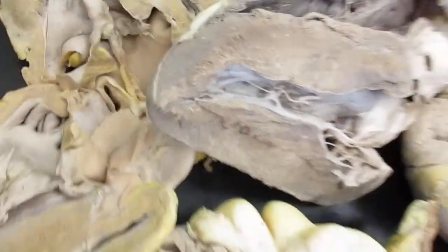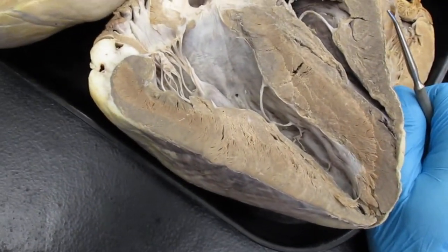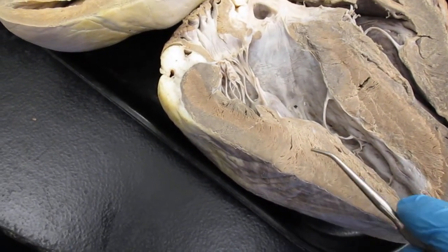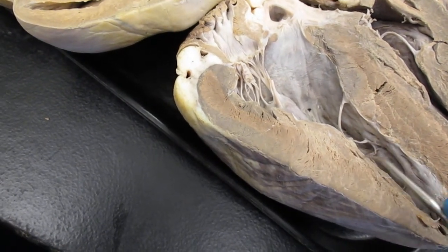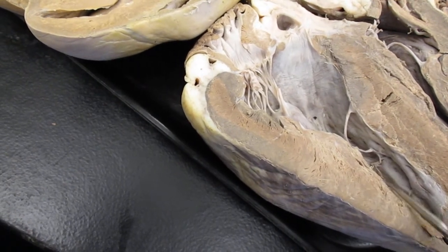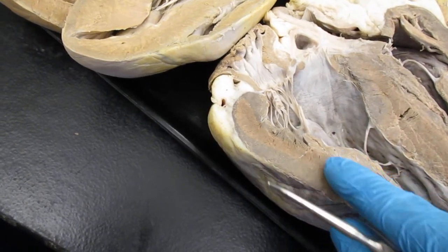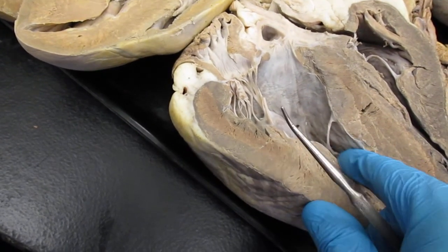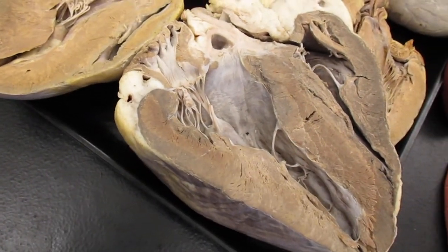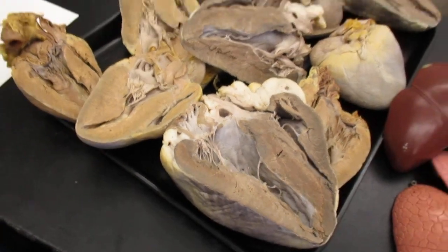Oh yes, we got some more things. We have the epicardium right here, myocardium, endocardium. Epi, myocardium, endocardium. So epicardium is very thin, myo is just a thick, very thick muscle layer. And then your endocardium right there. And I think we're done here. So let's move on to the next thing here.